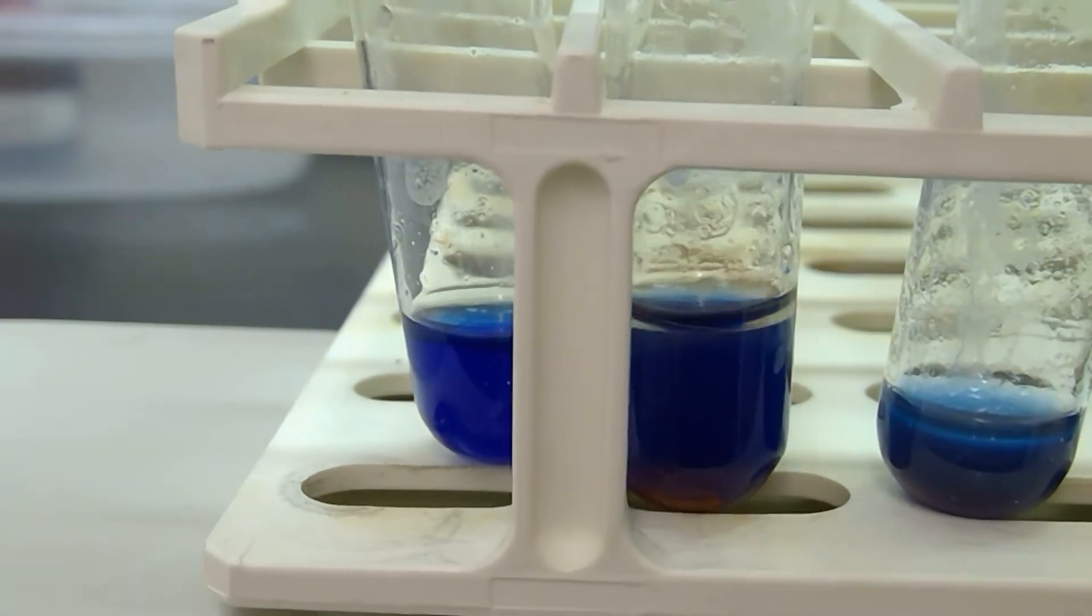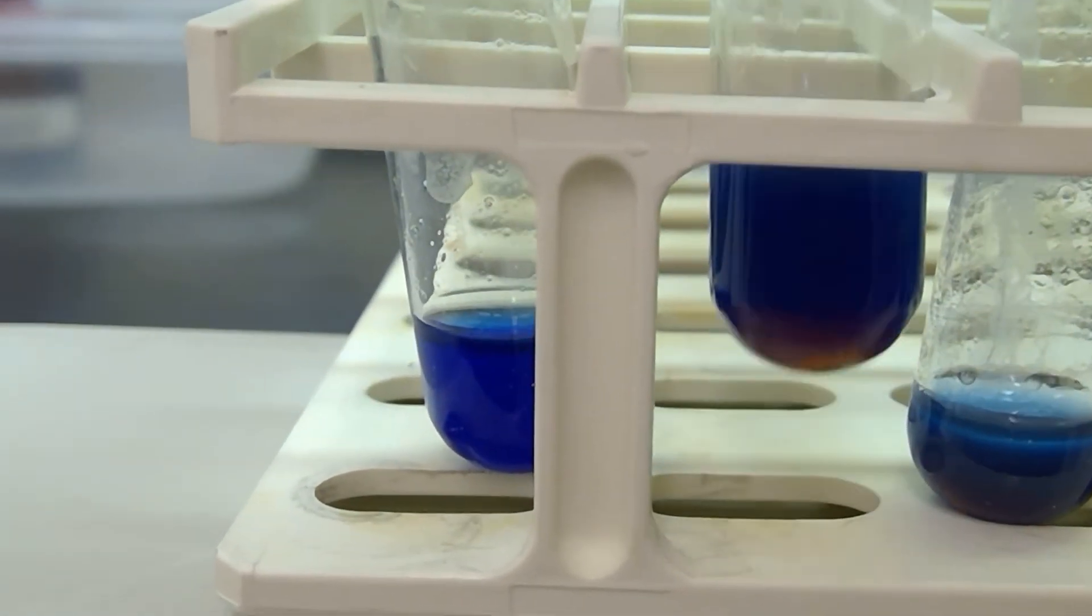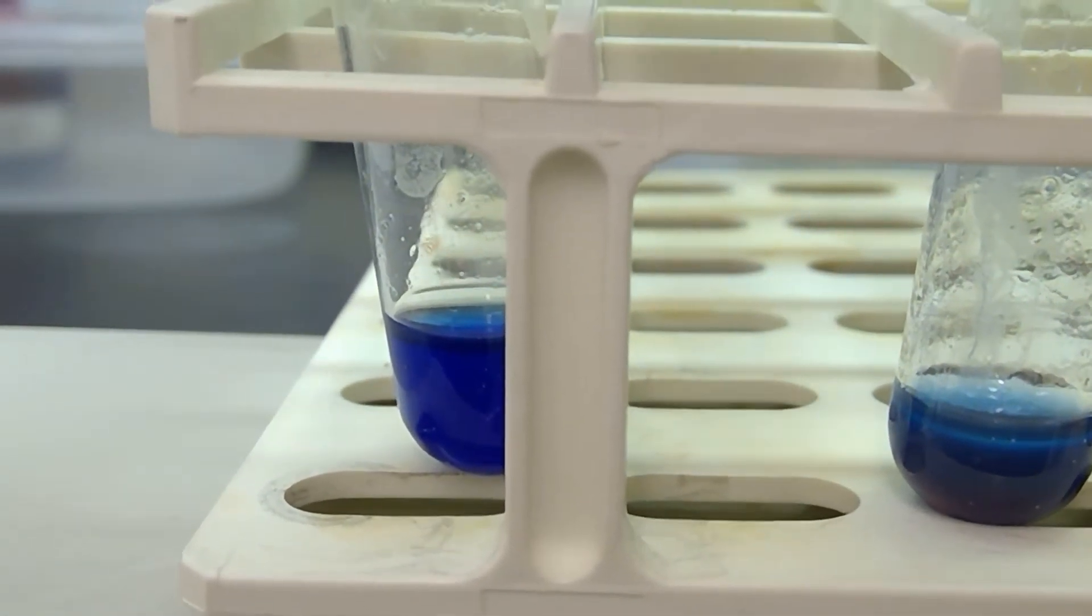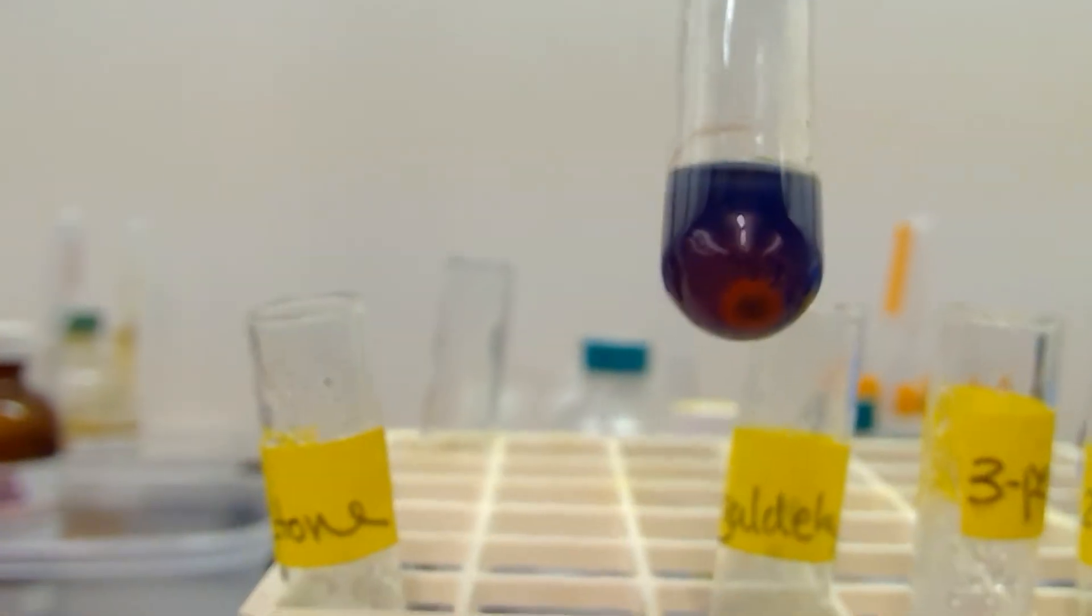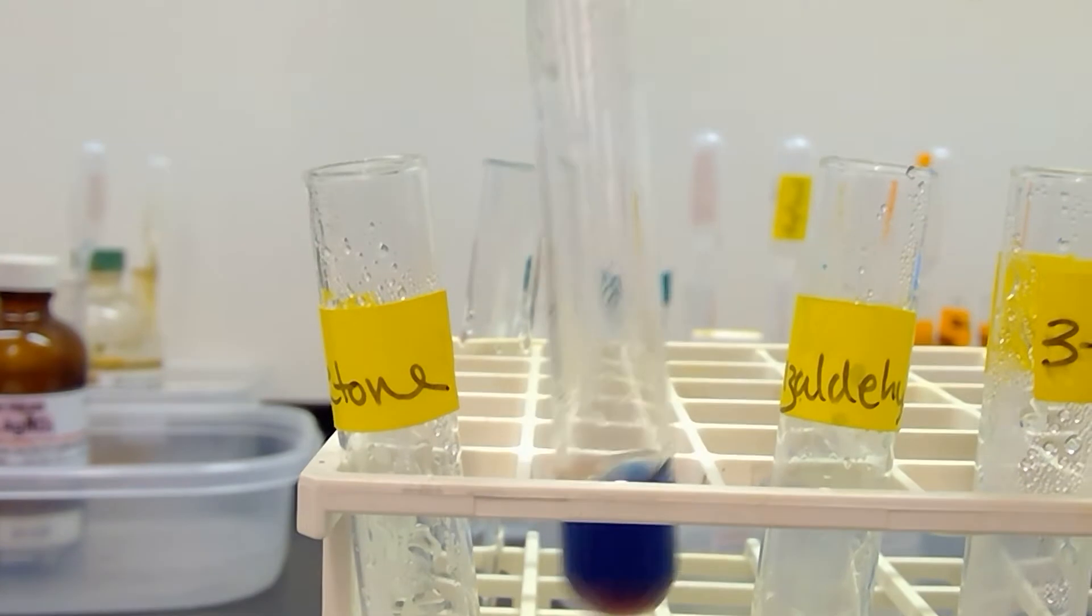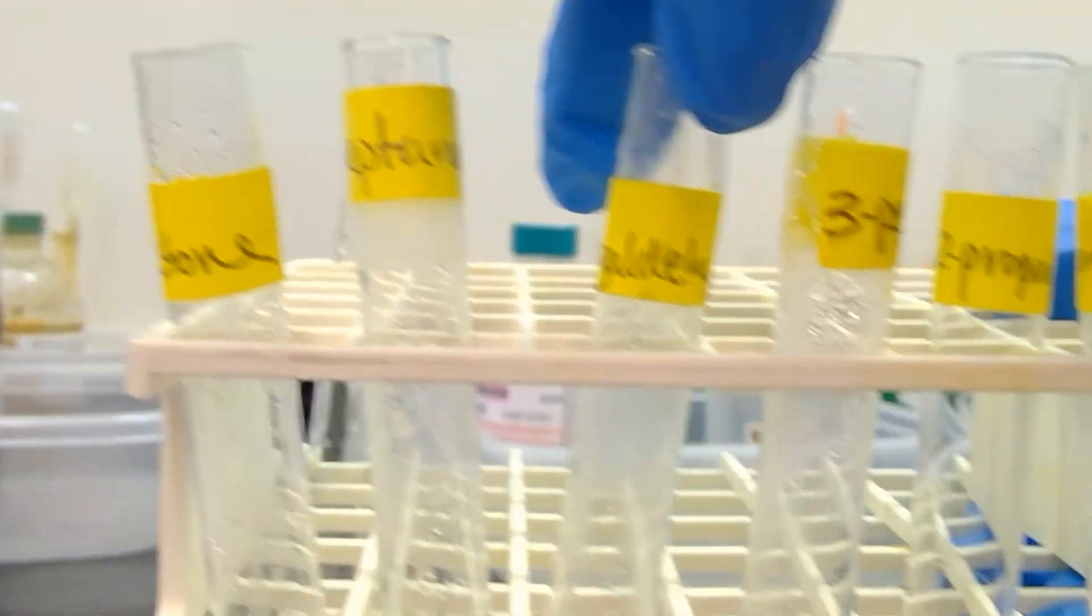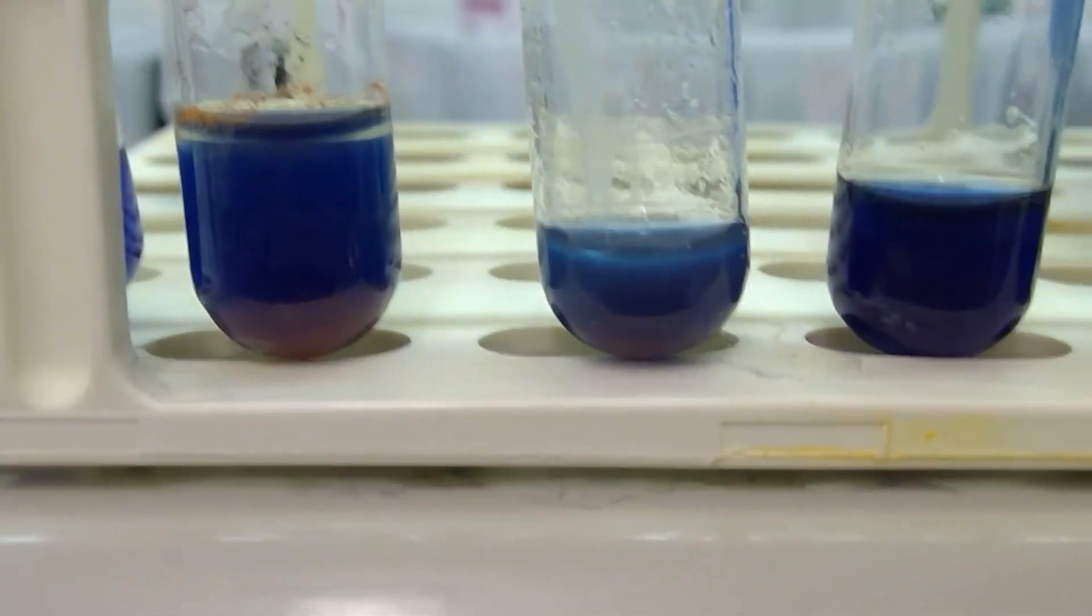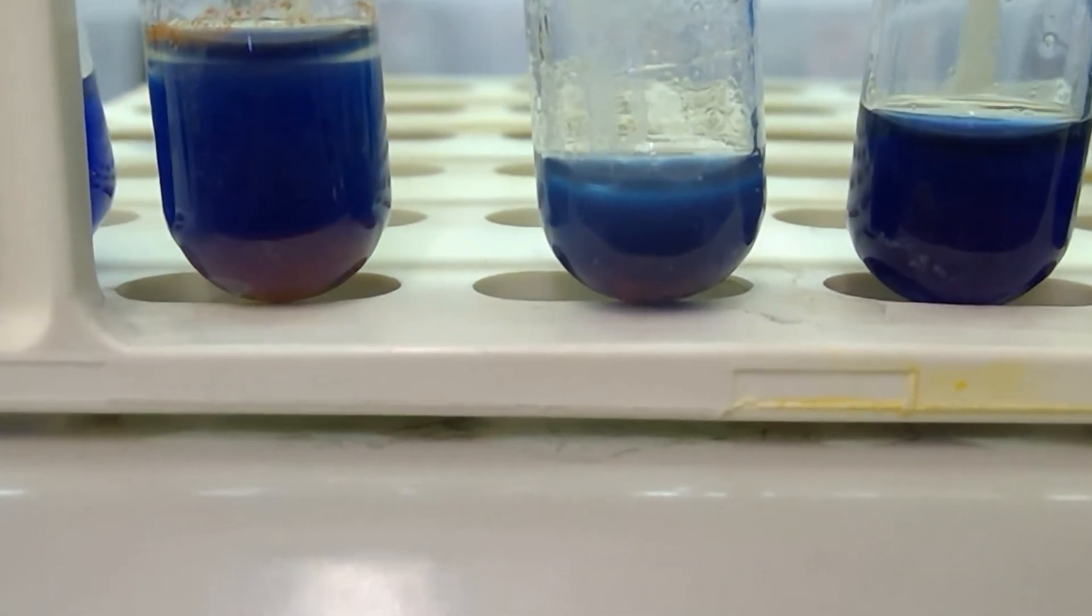Let me go ahead and show you the bottom of the test tube here. Very nice red precipitate for heptanal. For benzaldehyde we have some slight darkness to it, but no real precipitate that sticks around, and that's what we anticipated for benzaldehyde.